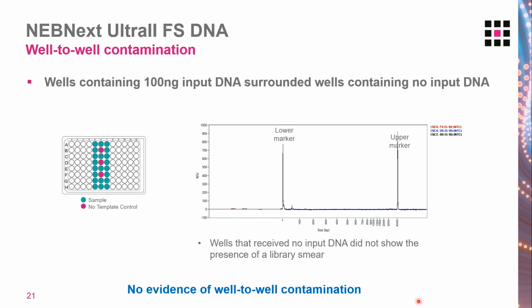So I did want to share some initial data we've collected looking at well contamination. So this is the setup that was used. We were looking at 3 wells in pink, which received no DNA input, and we surrounded each of these completely with samples where we had 100 nanograms per well of input DNA. So we processed all of these samples together through the whole library prep protocol.